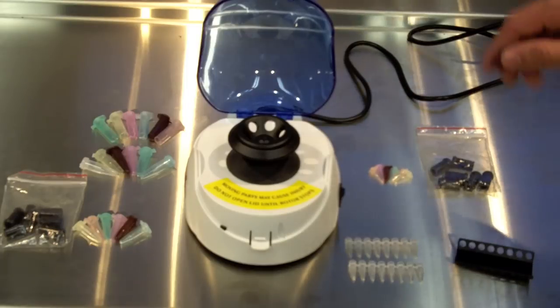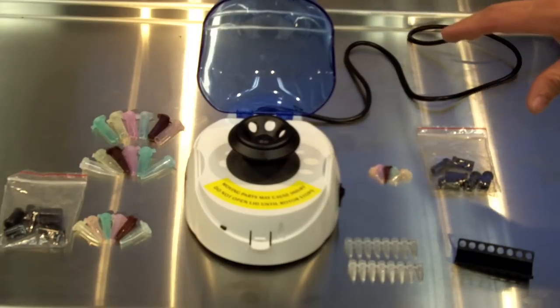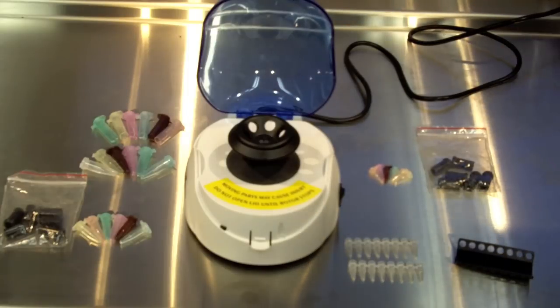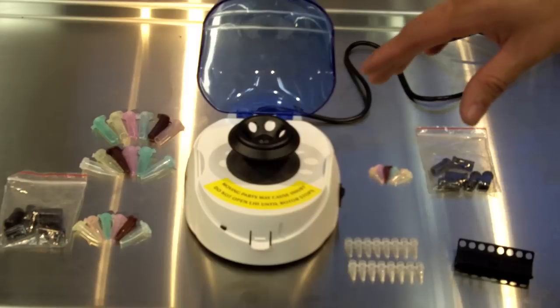In this video, we're going to be discussing the mini centrifuge from Extragene. This is a great, reliable mini centrifuge that's offered at a very budget-friendly price. One of the great things about this centrifuge is the number of accessories that come with it.